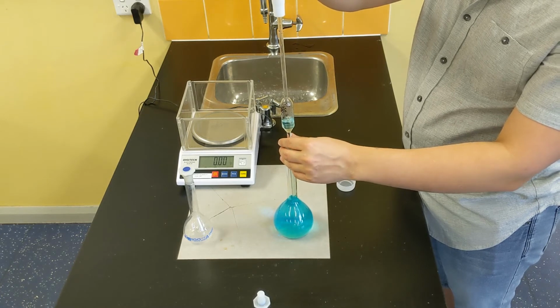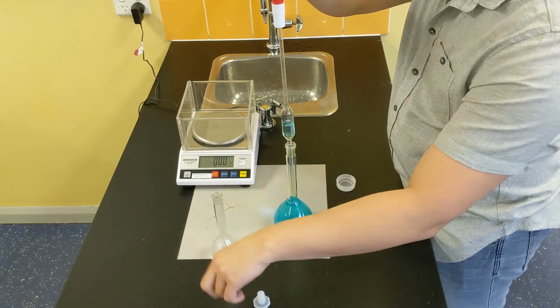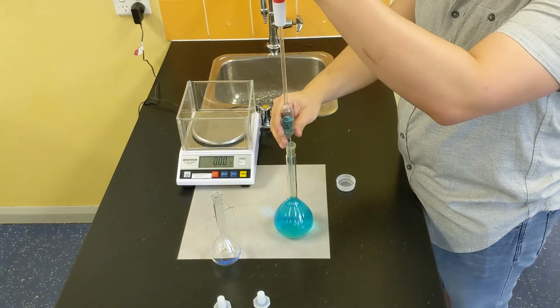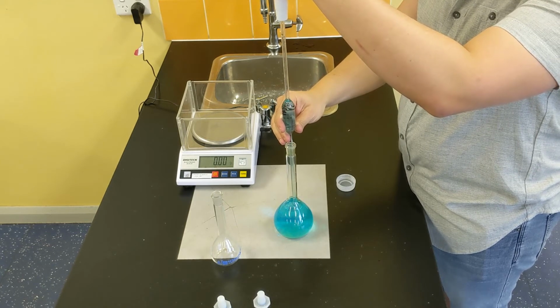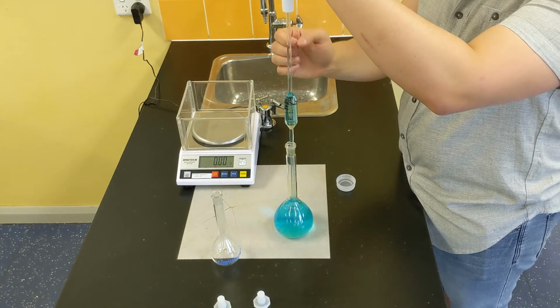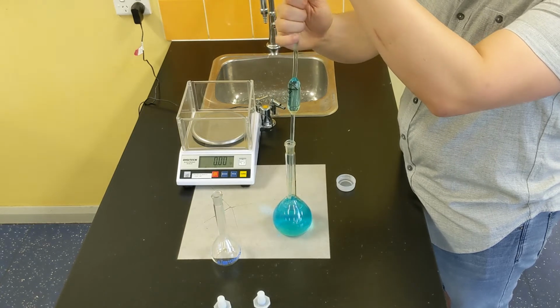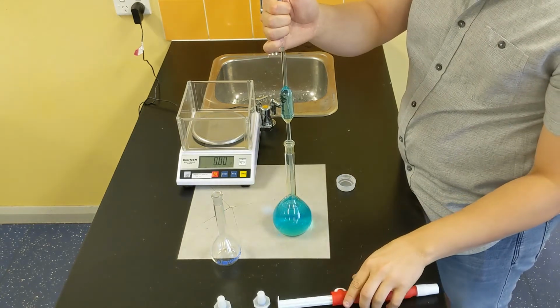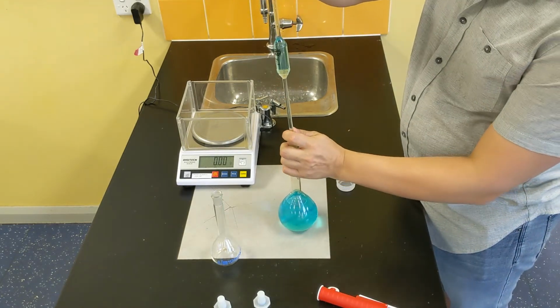What I can then do is place the pipette into the flask, and there's a dial on the filler, which means that it will draw up the liquid like a straw. So I do that really slowly, especially when it gets to the end, because it will draw up the top part of the glassware quite quickly. I then take the filler off and catch it with my thumb in the same way that you can stop liquid flowing out of a straw.